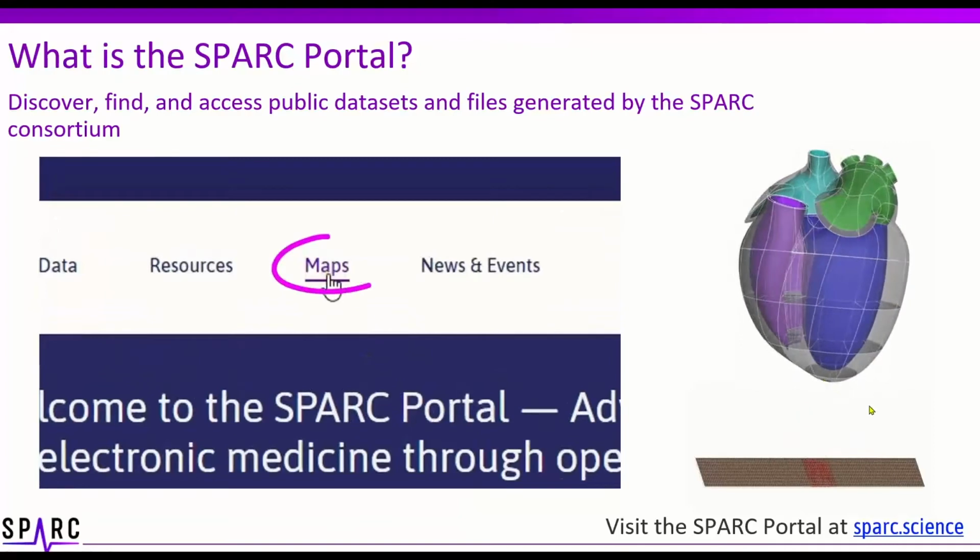The SPARC Portal contains maps which are useful for exploring the diverse experimental data generated by SPARC investigators, which are curated and made available for download.